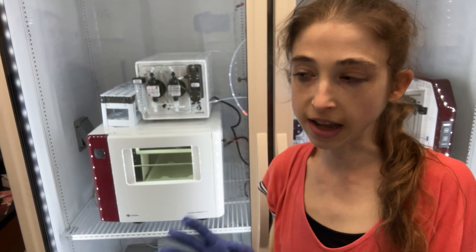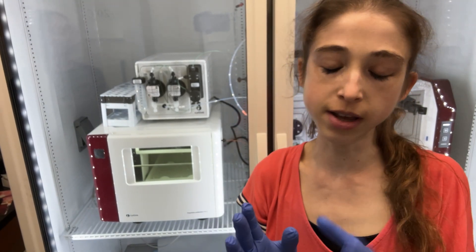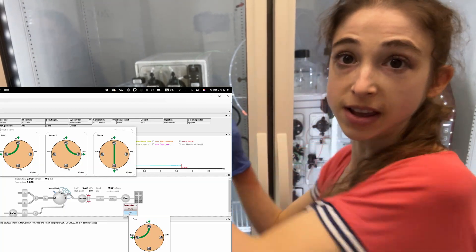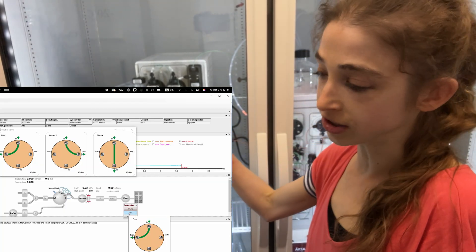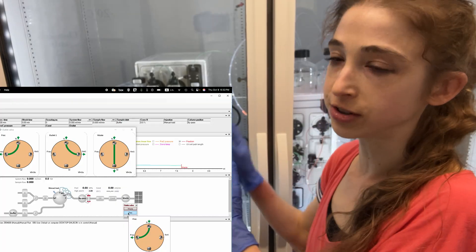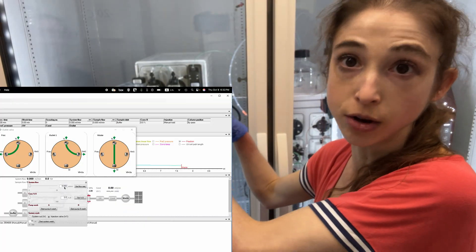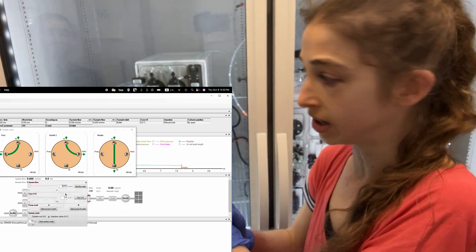When you're washing your lines on an ACTA, it's really important that you remember that if you're using a fraction collector, you actually go and wash the line that goes to the fraction collector.